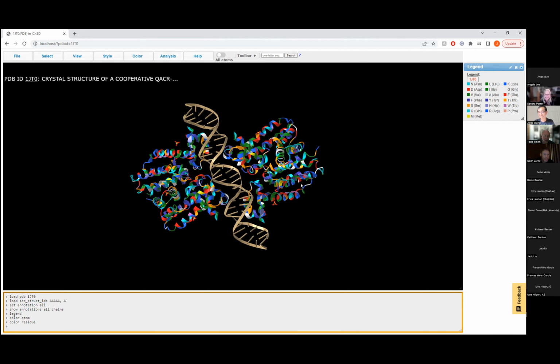Great. It's amazing how you take all that work and it's like, oh, it's one feature. But part of why we're doing it, and a couple reasons, is one, figuring out how to do things within the iCn3D code base, and the other is thinking about how we use iCn3D in education. When people are looking at structures, there's a lot of information being conveyed from a chemistry perspective, and being able to get at it through these legends, we think can help in the classroom.